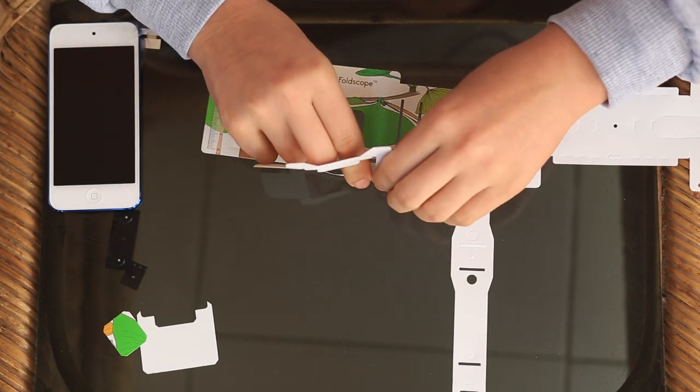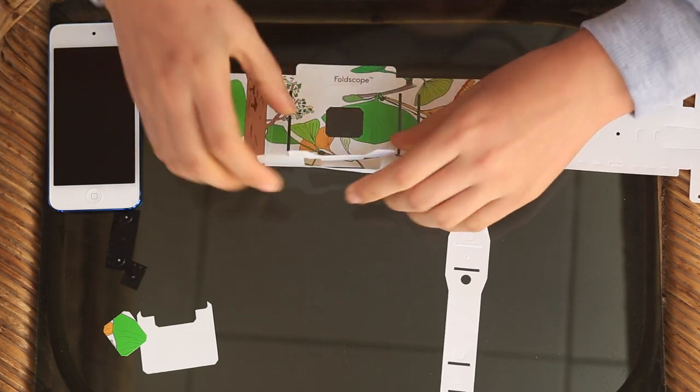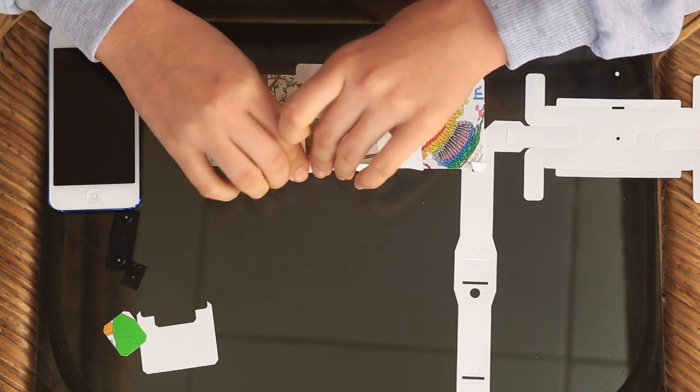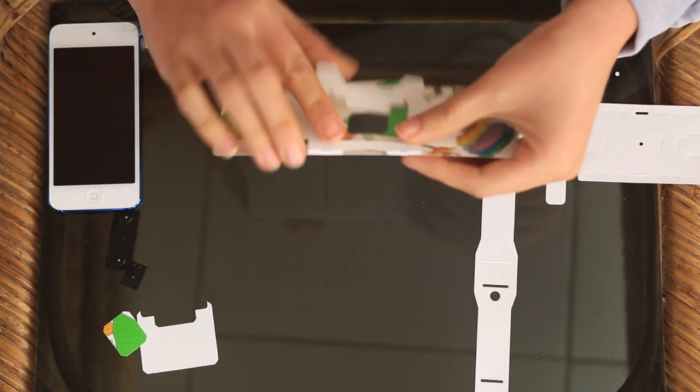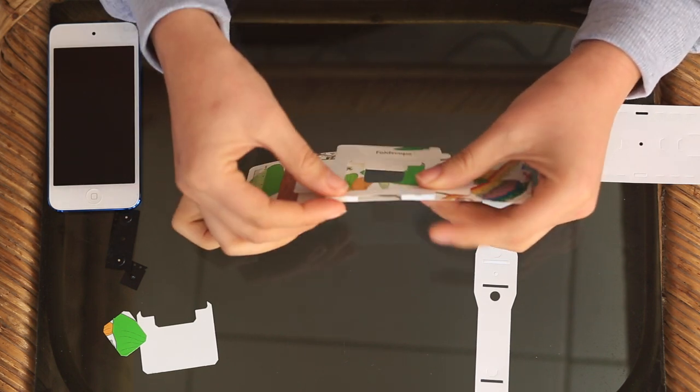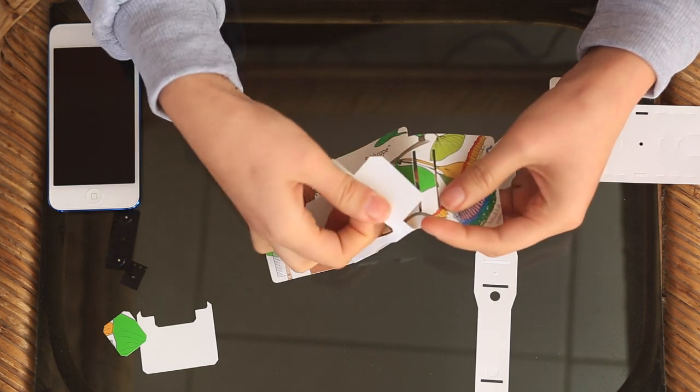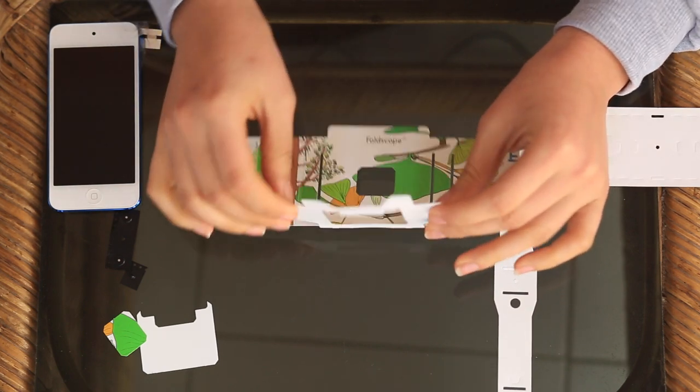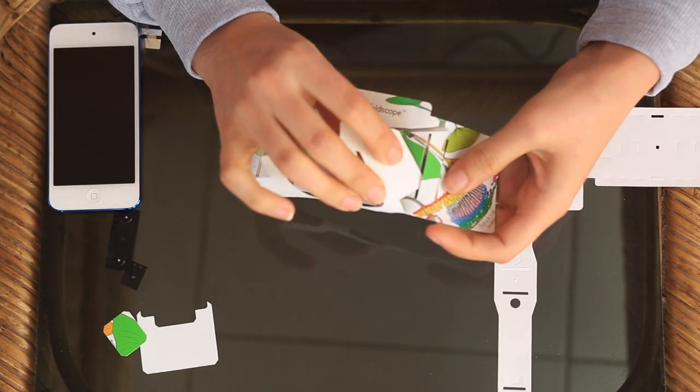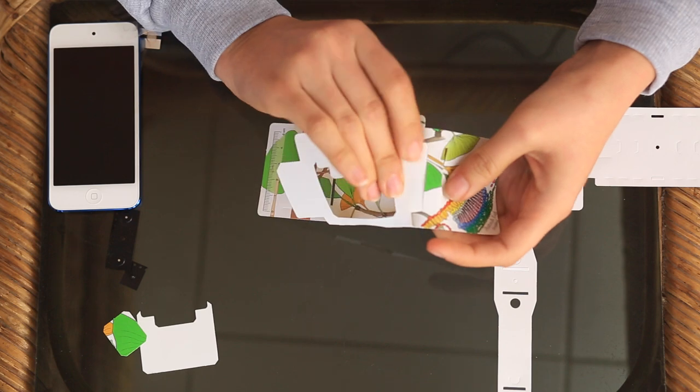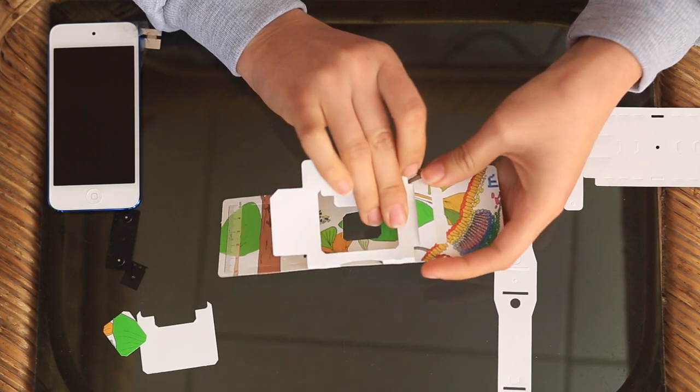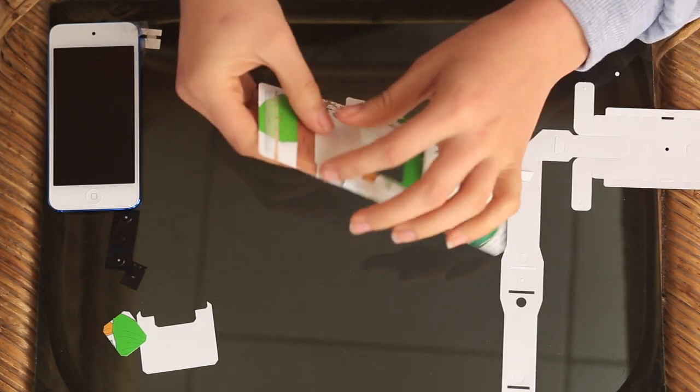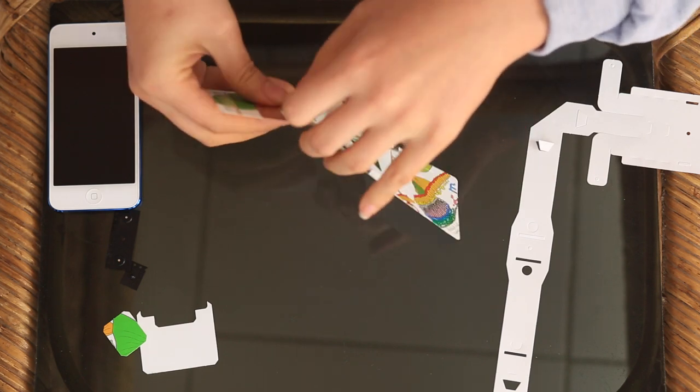Then you fold it along the second part of the perforations in order to make something square where a slide will fit in. Then you take the wings of the butterfly, call this part the butterfly. You take the wings and you weave them under and then over the back part of the colored panning stage.